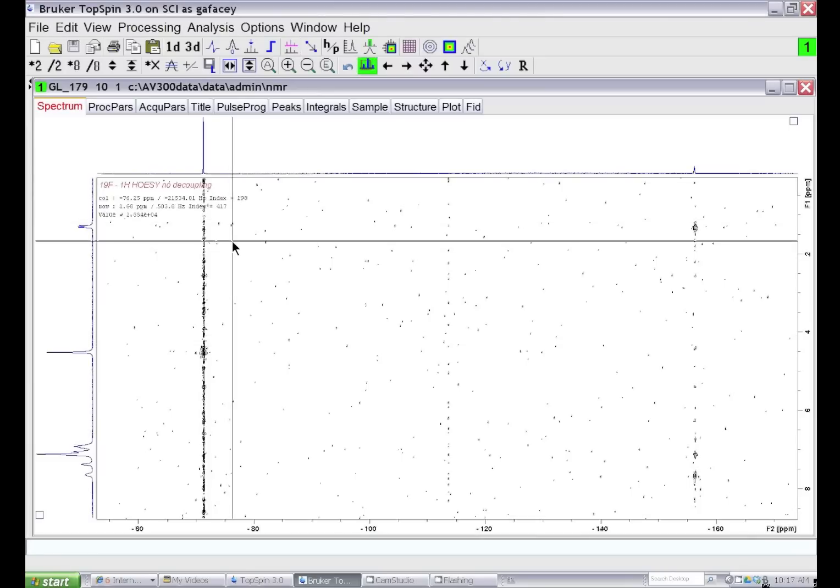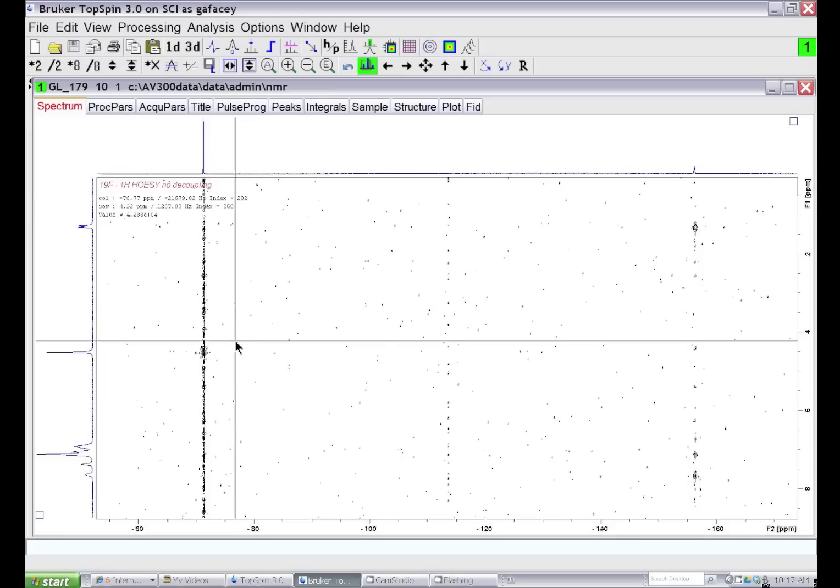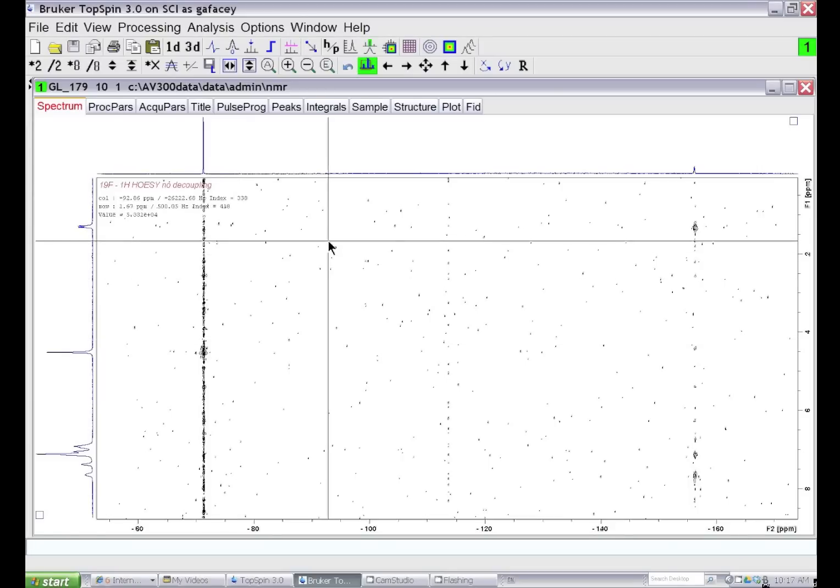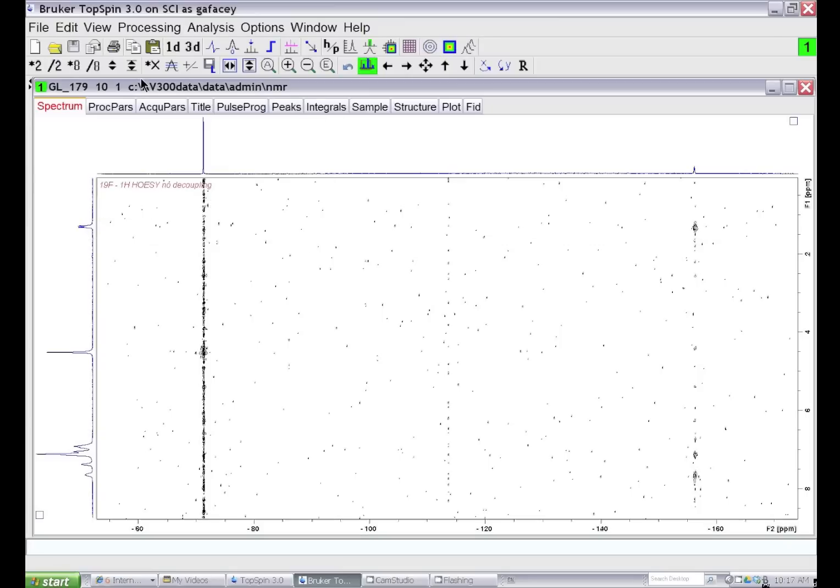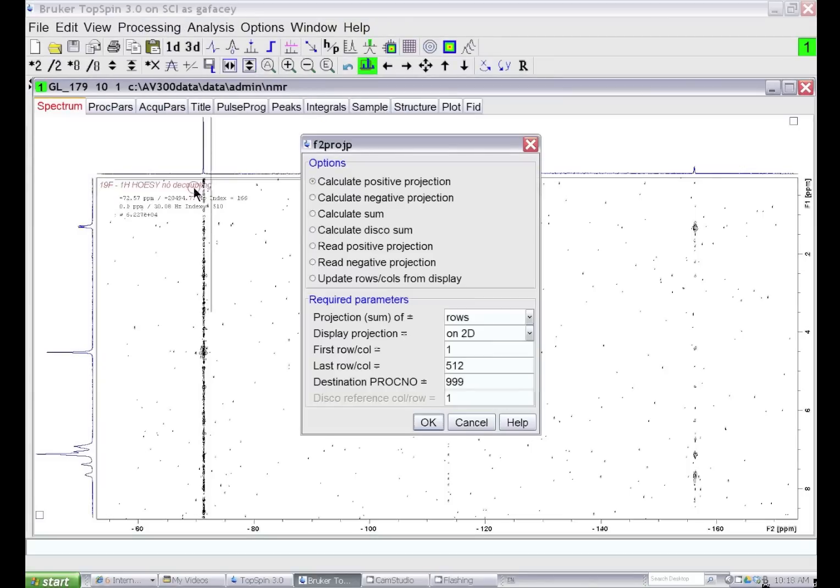What we want to do is take the projection of these rows, store that projection, and then subtract it from every single row in the two-dimensional NMR dataset. The way you do this is under the Processing menu on top, go to Calculate Projections. We want to calculate a positive projection, so we'll select this option.